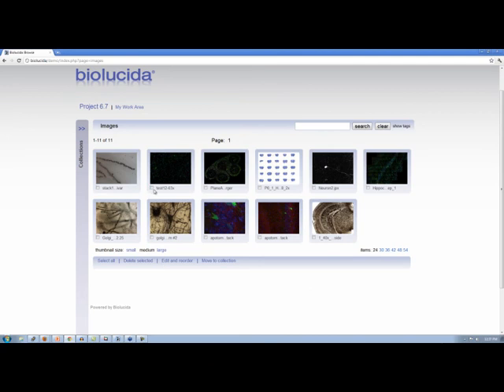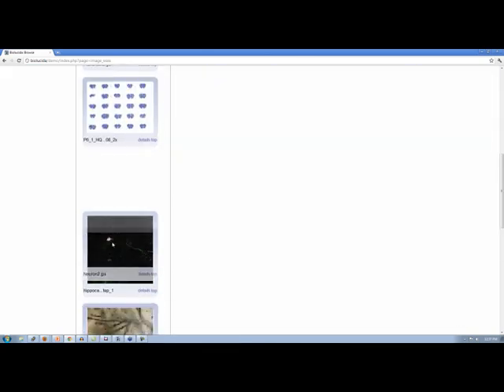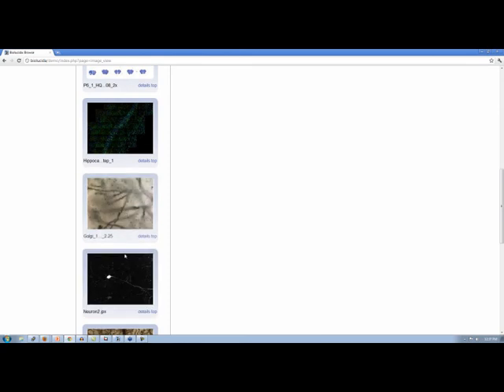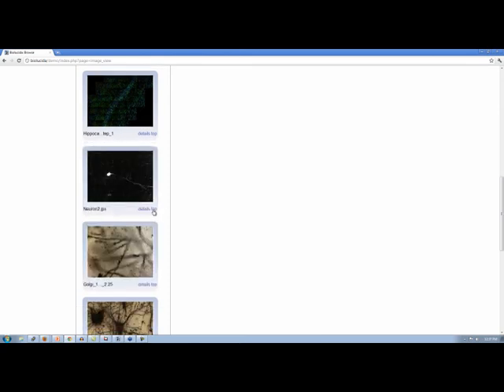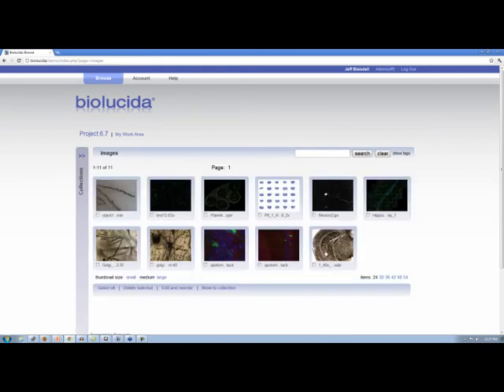Yeah, you definitely can. You can select any of the images you wanted. Here, I'll just grab all these. If you wanted to, there's an option that says Edit and Reorder. You can move down and you can just drag and drop images as you see fit, and you could even hit top, which would move that image to the first. And what that really allows you to do is reorganize those, as we said. So if you had some images that were later in your collection, you used them frequently, you wanted to open them up or be first in the collection, you could reorder them that way.